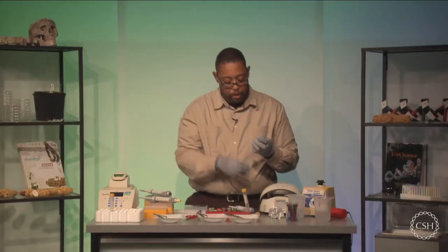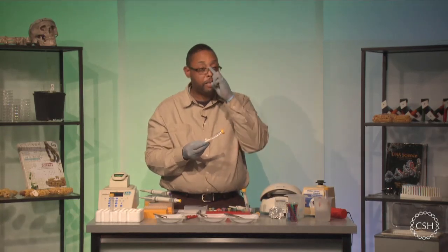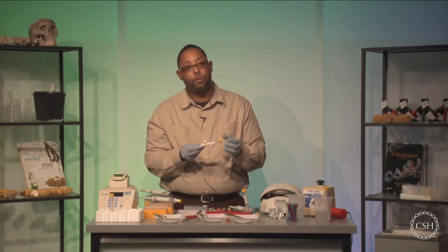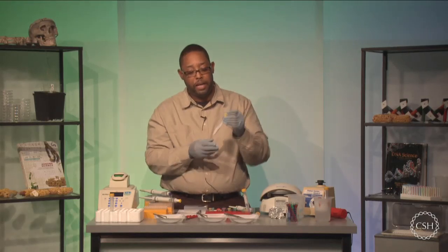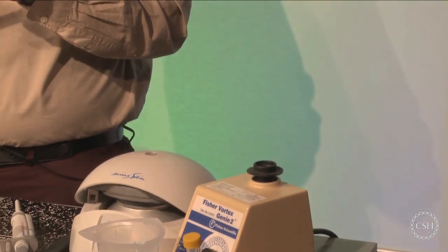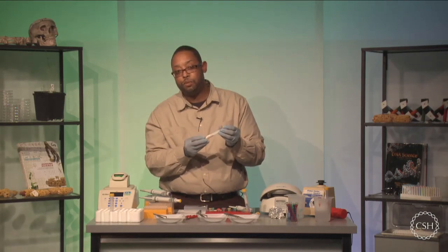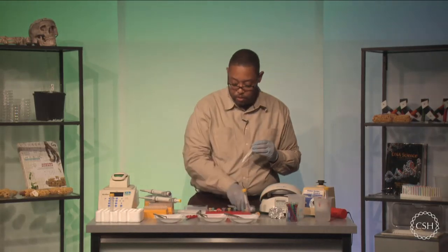Now, one thing I want you to be sure of is that when you have the silica resin, you've mixed it up pretty thoroughly. It sometimes can have a sediment which falls to the very bottom. If you haven't mixed this very well, when you flip and flip back, you're going to see that there is sort of a paste at the bottom of the test tube. If at all possible, hand vortex, or if you have a vortexer itself, please use that to mix up your sample. Let's try to avoid having a sediment of material at the bottom of the silica resin test tube. You should not have this when you're working in the classroom because you will have a smaller aliquot of this. I'm going to continue to add this to my other test tubes.